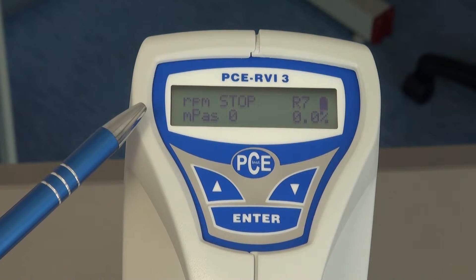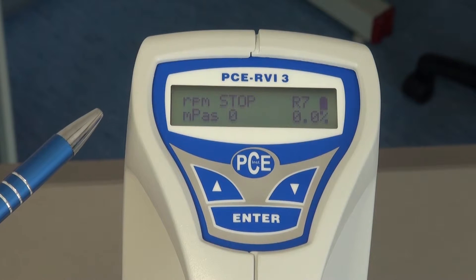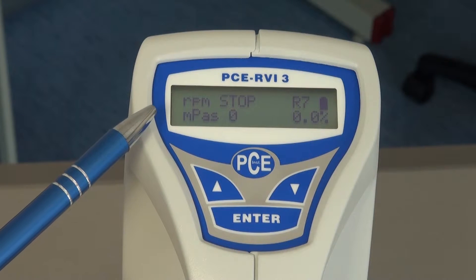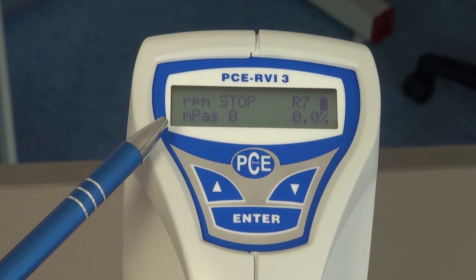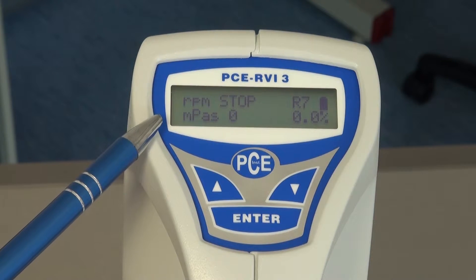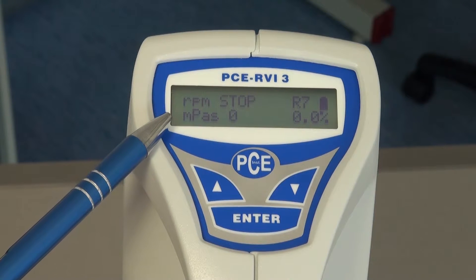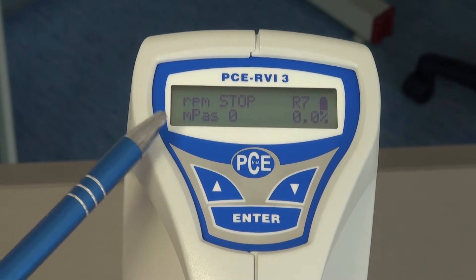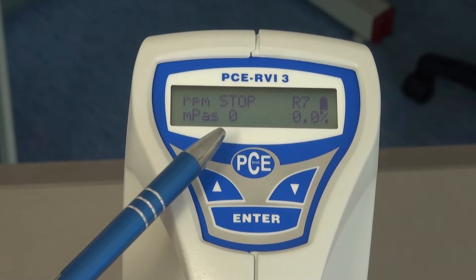The PC RVI3 is available in two models. One in the model 20 revolutions per minute and one with 60 revolutions per minute. Underneath the revolutions per minute I can see the measured viscosity. Here it is at 0 because the measuring device is not working at the moment.